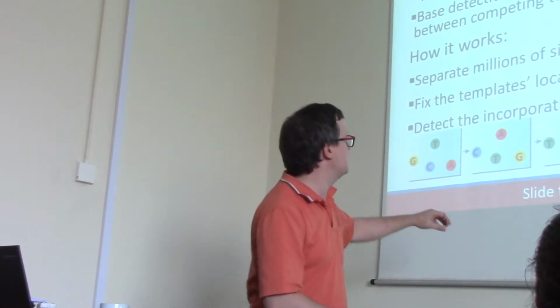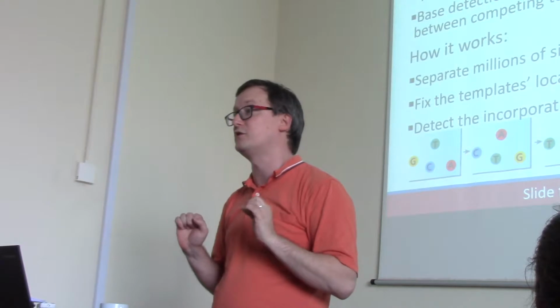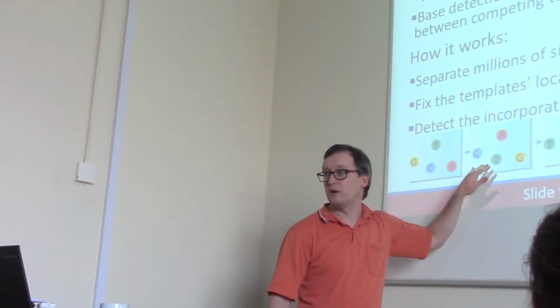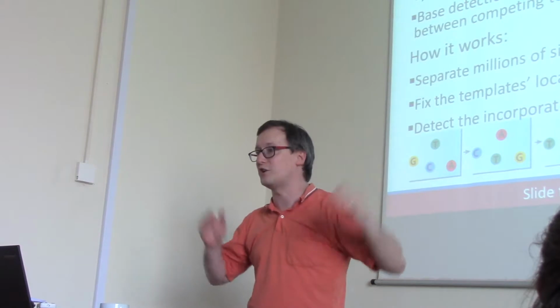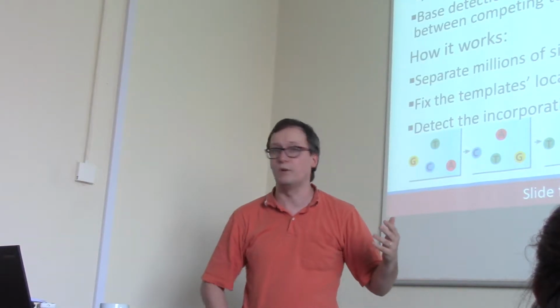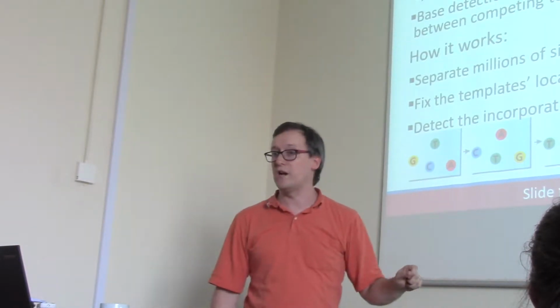So I want you to think for a moment about these 5 frames, and I want you to think of them as though they're a cartoon. It may not be obvious at first glance, but each of these, if laid on top of the one before it, will position a dot over this. So think of these as like cells in a cartoon. Our first glimpse of these 4 different sequences that we're trying to sequence shows a T at this top one, a G to the left, a C at the bottom left, and an A to the bottom right.